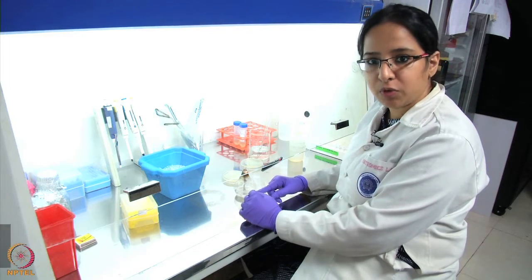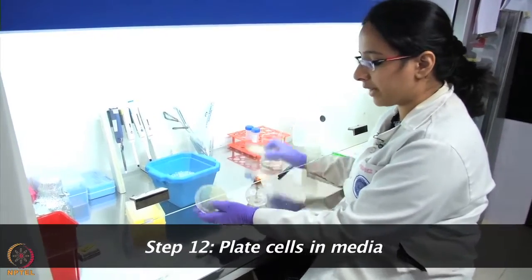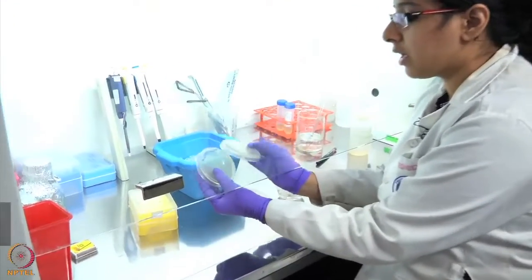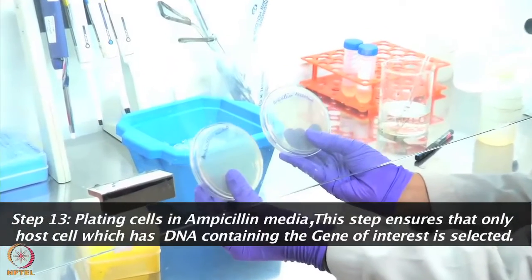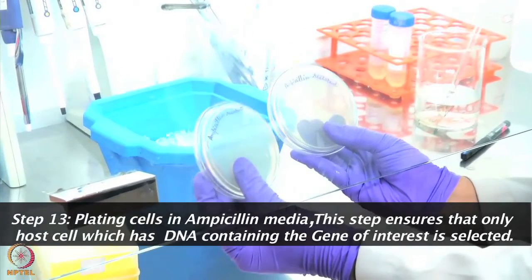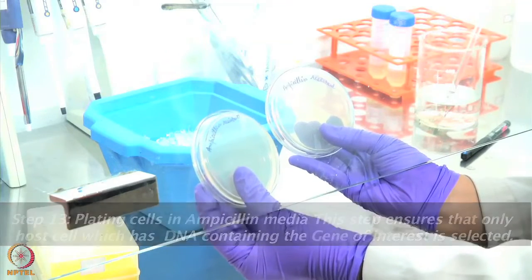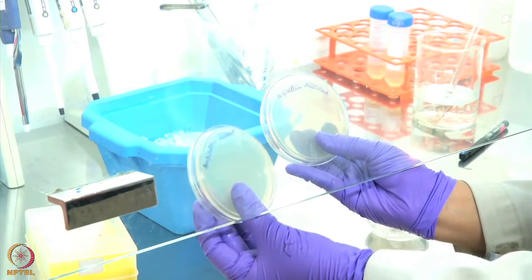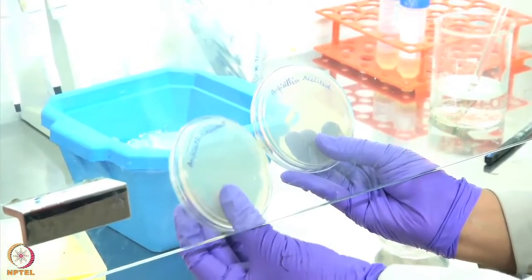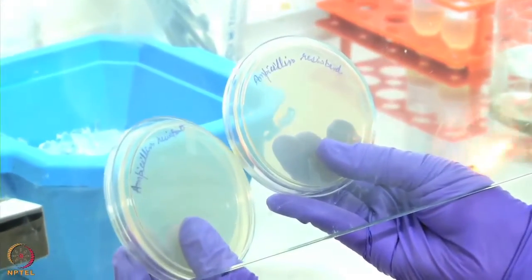So now we will perform the plating. As you can see, we already have plates, LB agar plates. These plates have a lot of components which will help the bacteria to grow. Additionally, we have added the antibiotic ampicillin because our vector, the plasmid DNA, has an ampicillin resistant gene, so that when we plate our ligated product onto this, only those colonies will show up which have our vector.